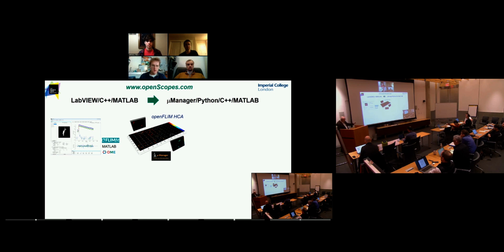We built a hardware platform on Micromanager, and we switched to Micromanager for all the reasons Kevin's just said about Labview, the code getting really labyrinthine and getting killed by updates. And since then, we've also been asked to work.